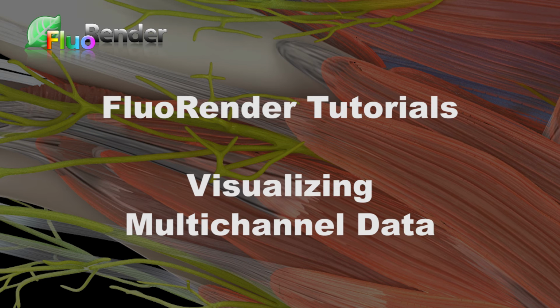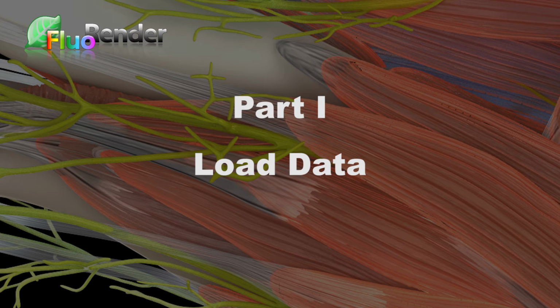FluoRender tutorials. Visualizing multi-channel data. Part 1. Load data.